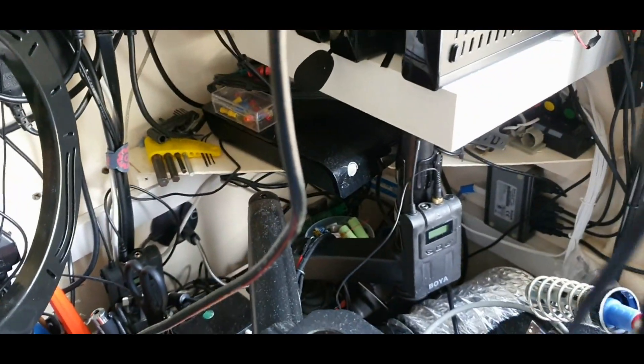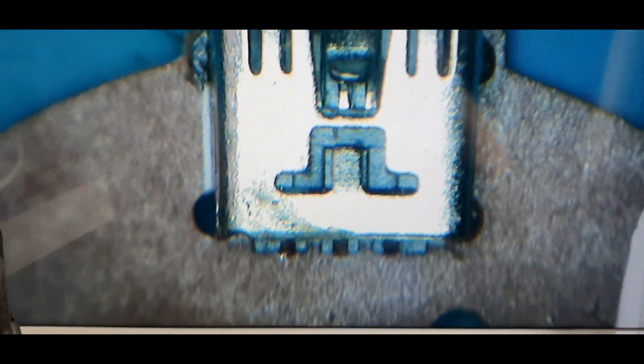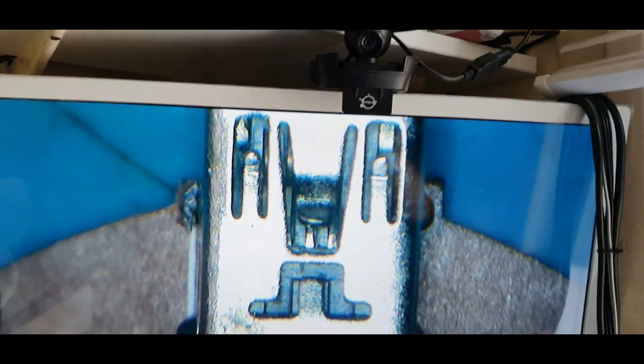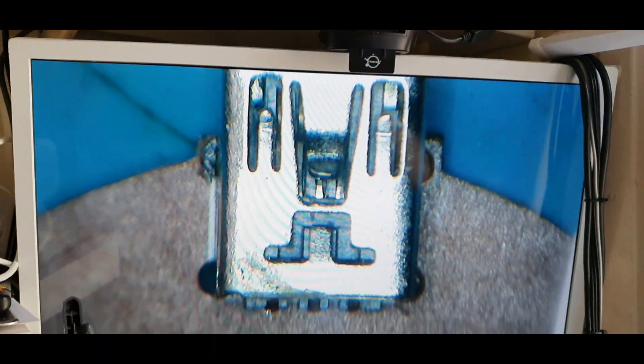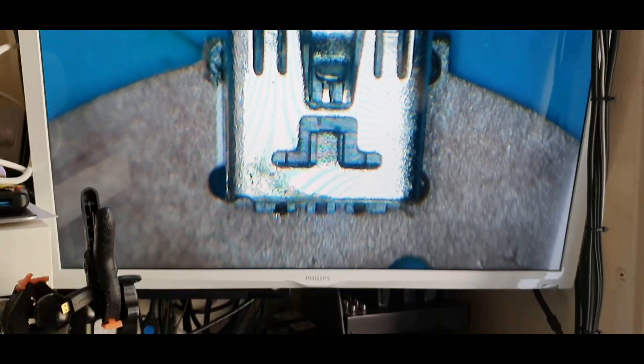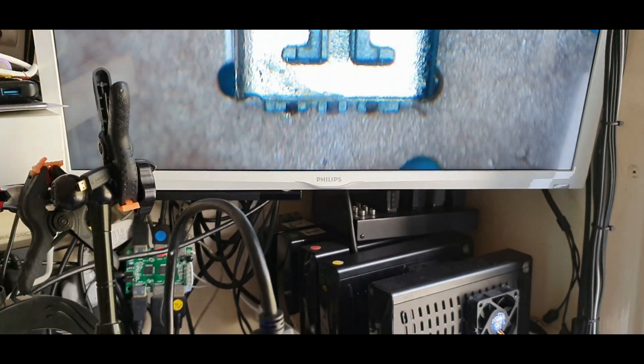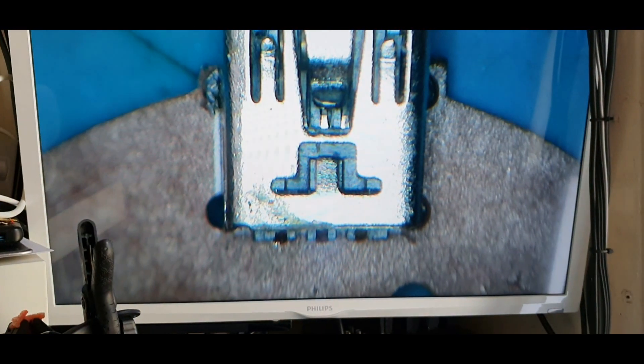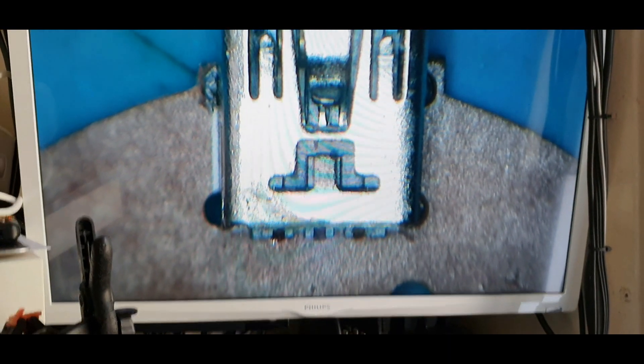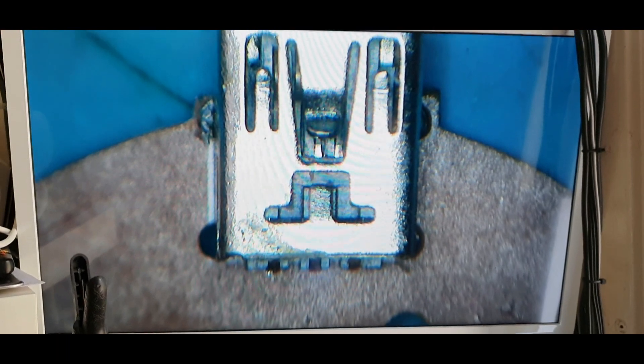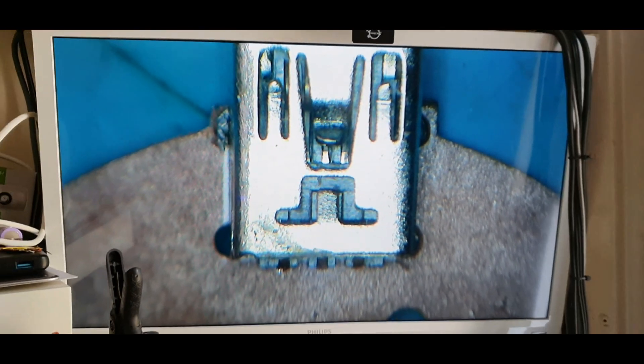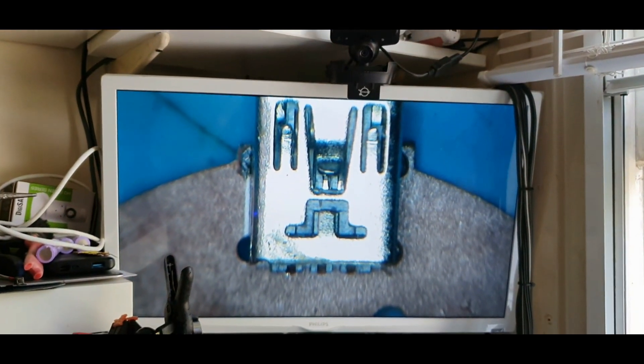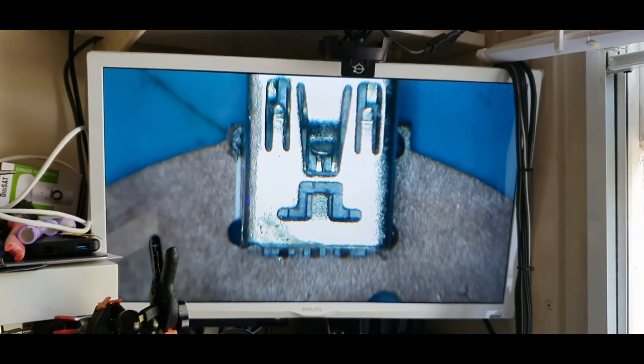Camera. I'm going to have to focus down. Okay, that's with that. The view is not wide.